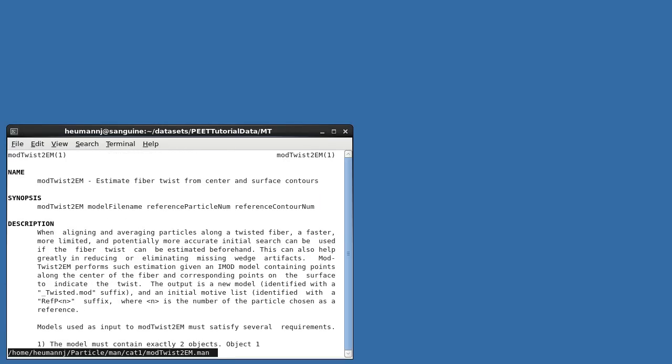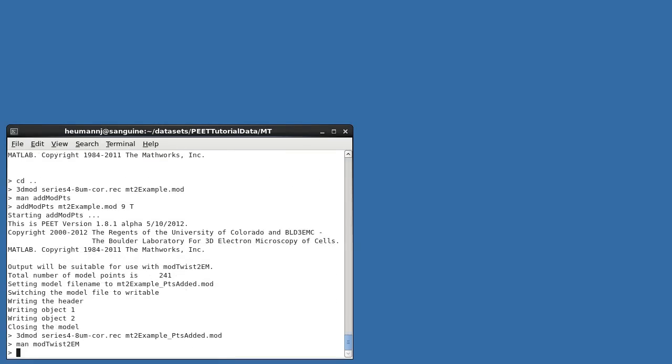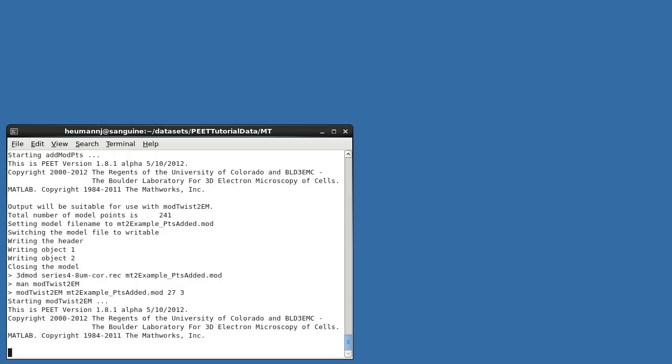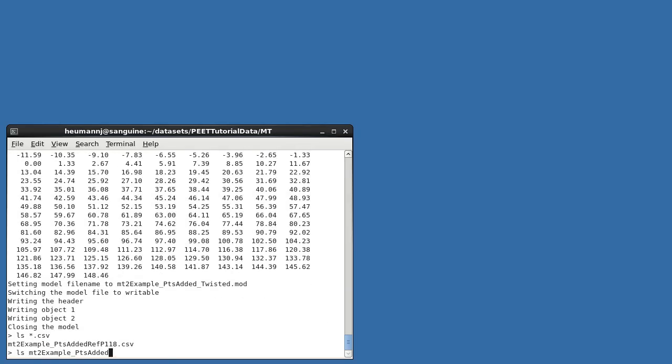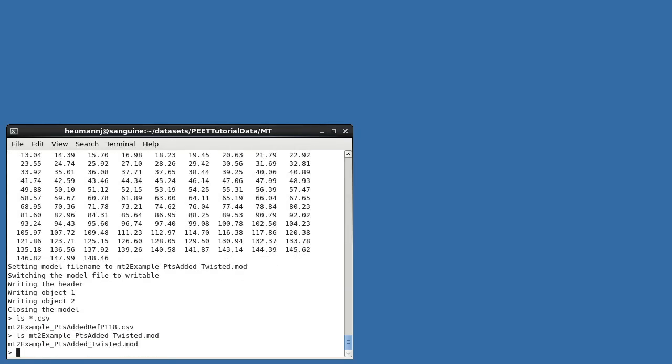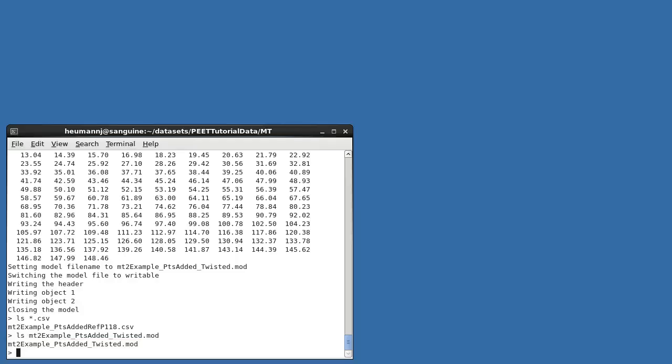If I now run modTwist2EM, choosing a particle near the center of the microtubule as the reference, you can see that we've created two output files. An initial motive list, whose name identifies the number of the reference particle used, and a new model, whose name includes the tag Twisted. You're free to rename these files, and in fact I'd recommend it so as to make their purpose more obvious. The single point overlap between adjacent contours is no longer needed at this point, and will have been removed from the output files. Both Objects 1 and 2 will still be present in the new model. This causes no difficulty for PEET, however, since it processes only particles in Object 1 during alignment and averaging.